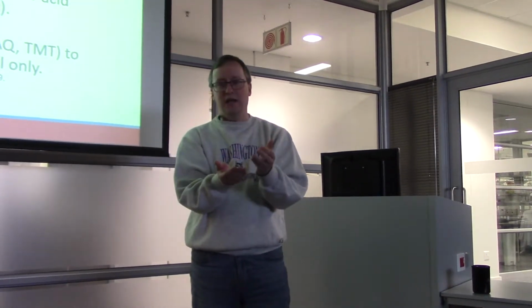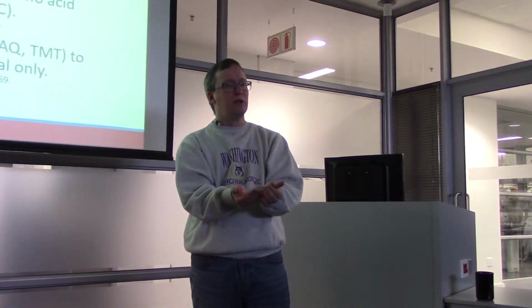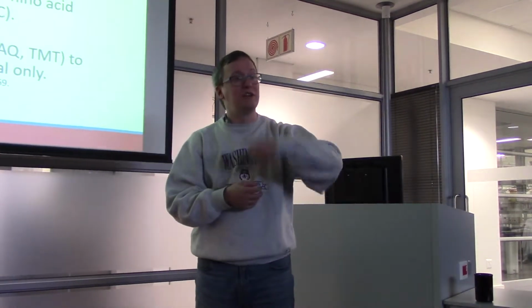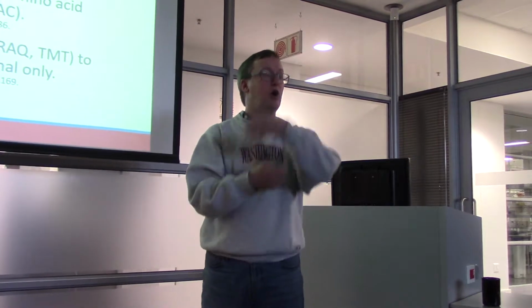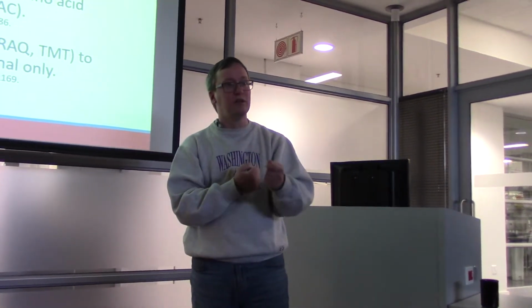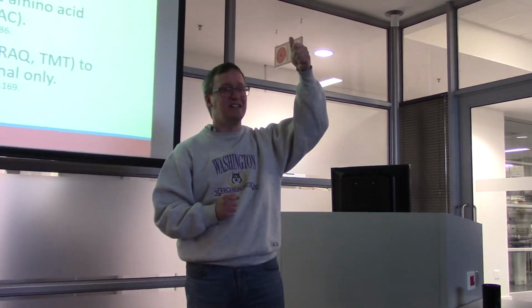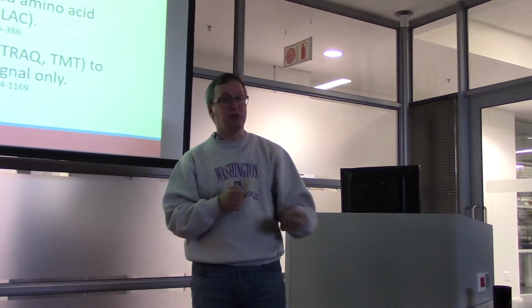So if I ensure that the only carbon source available to this microbe is heavy labeled glucose, then over generations and generations of these microbes growing, the fraction of all of the carbon in these bugs that is comprised of heavy carbon is going to rise and rise and rise, and it's going to get really up in the high 90s of how much of its overall carbon comes from this labeled source.